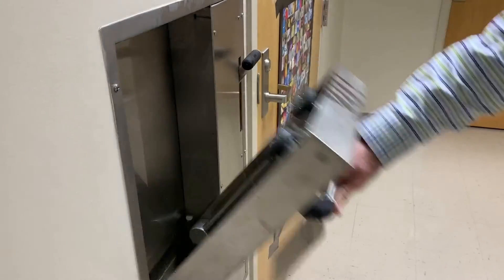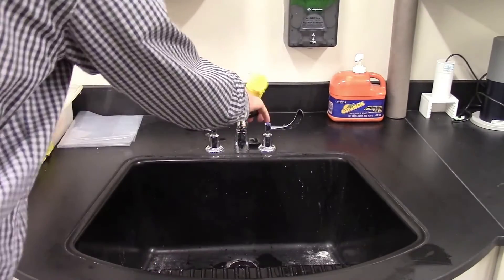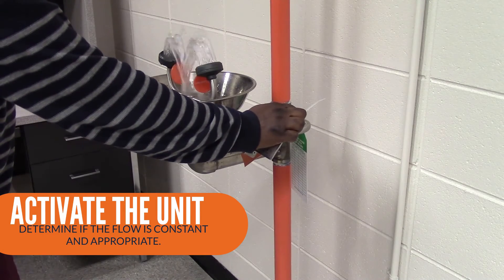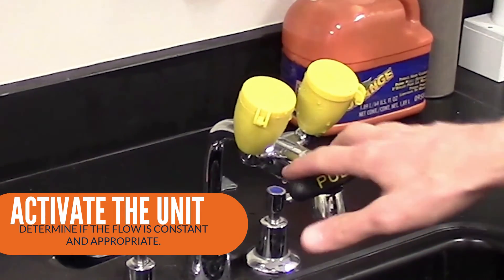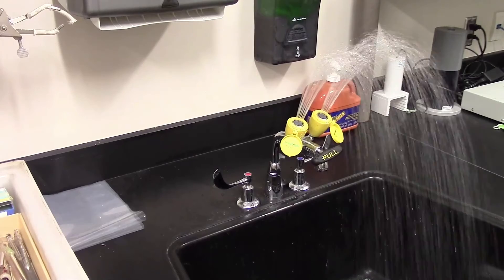Now it's time to test your eyewash. Place a bucket under areas with no plumbing to gather water during flushing. Next, activate the unit by pushing the lever by hand or pushing the foot pedal to determine if the flow is appropriate and constant. The protective eyewash cover should come off when the eyewash is activated, and water should flow from both eyepieces for units with two eyepieces.